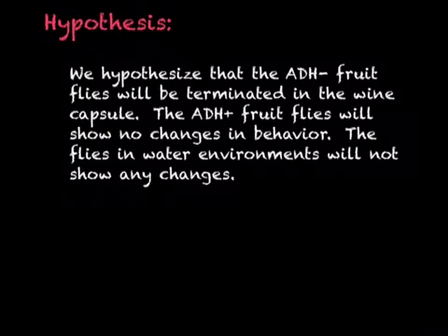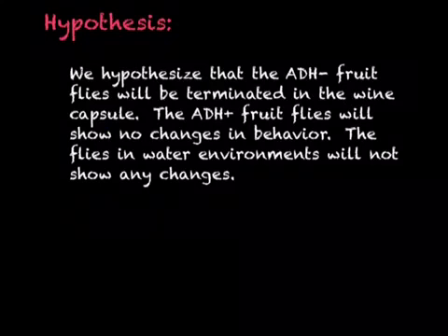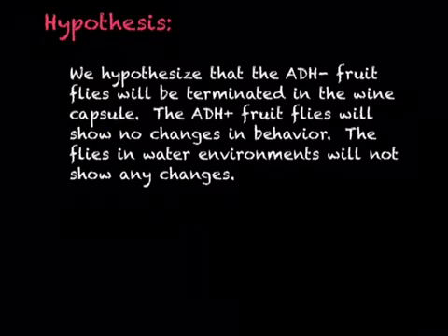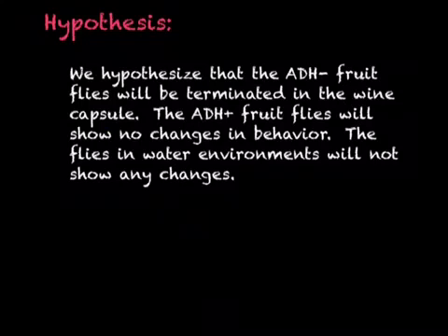For this experiment, we hypothesized that the ADH minus fruit flies will be terminated in the wine capsule. The ADH plus fruit flies will show no changes in behavior, and the flies in water environments will not show any changes.